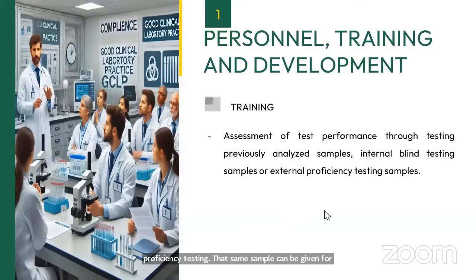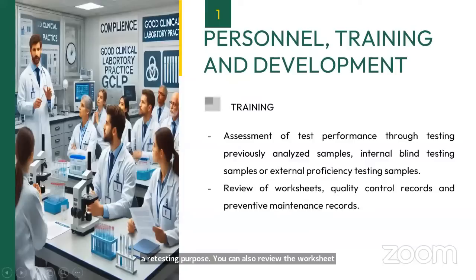You can also review the worksheets, quality control records, and maintenance records. Whatever activities we are performing, we have to record those evidences.